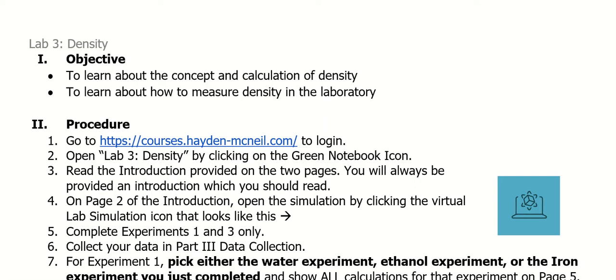Everyone. So the purpose of this video is to discuss, as usual, the steps that you will be taking to conduct Lab 3. In Lab 3, you are learning more about the actual measurements of density.